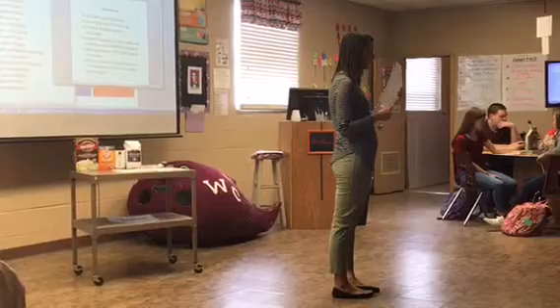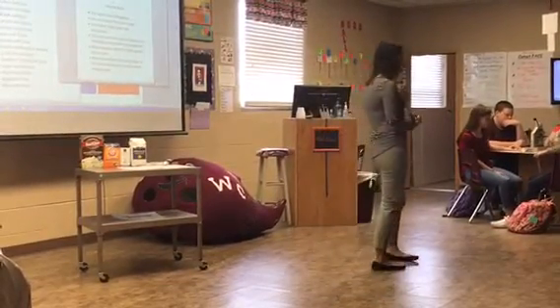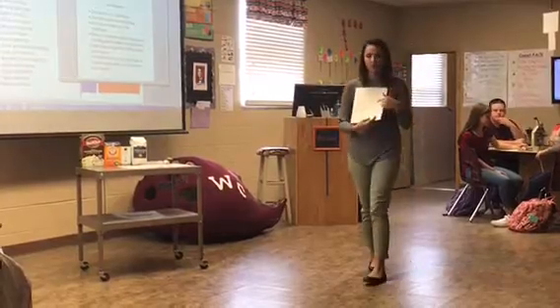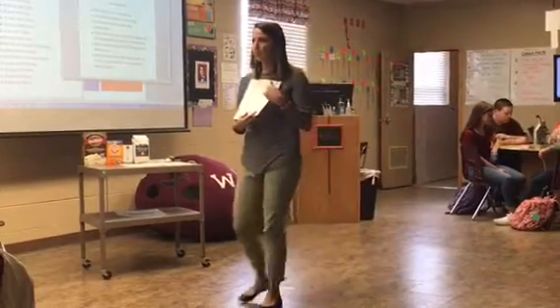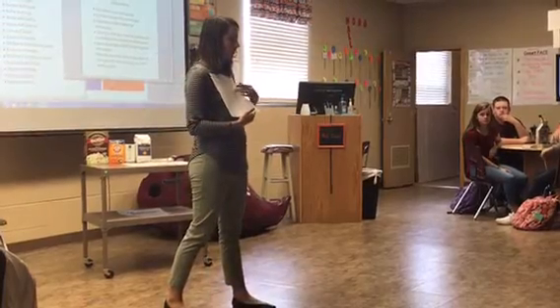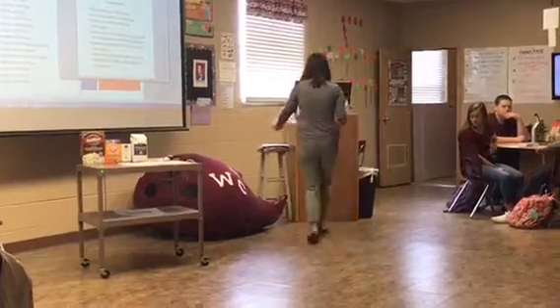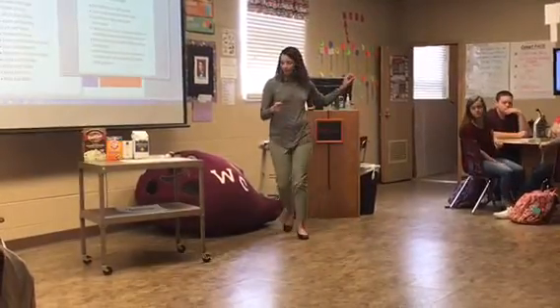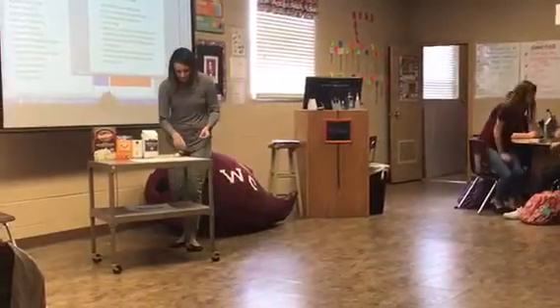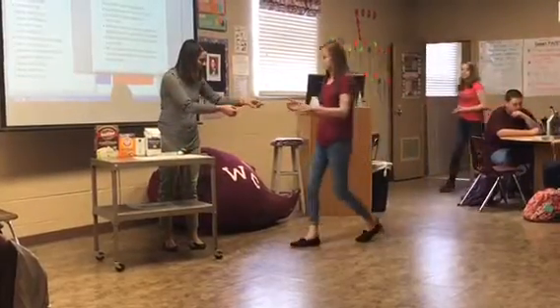Good so far? Okay, and then in the second little column in this table, you're just going to draw a picture of what it looks like under the microscope. You can draw it either on medium or low objective. Got it? So I'm going to see a couple people from table 1 come and get your slides. So each table gets 1 slide of each substance.